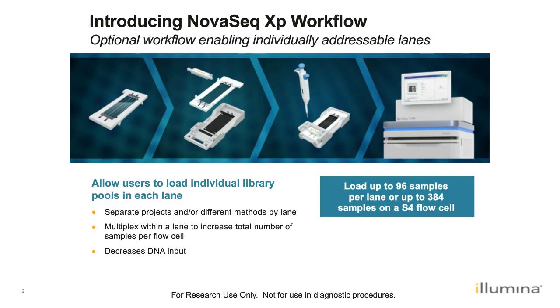So the XP workflow is very similar to the CBOT Duo for those of you familiar with the HiSeq 2500. In order to perform the XP workflow, you won't need a CBOT, but you will need to make a one-time purchase of a flow cell loading dock. You'll also need to purchase one XP loading kit per flow cell.